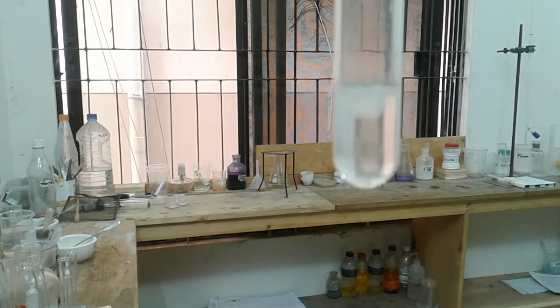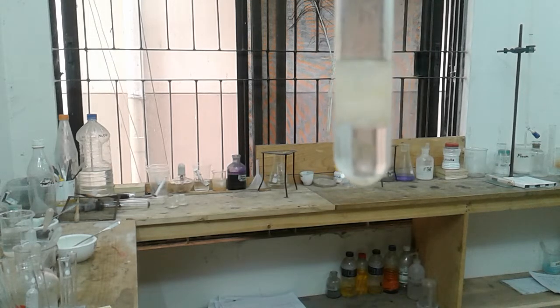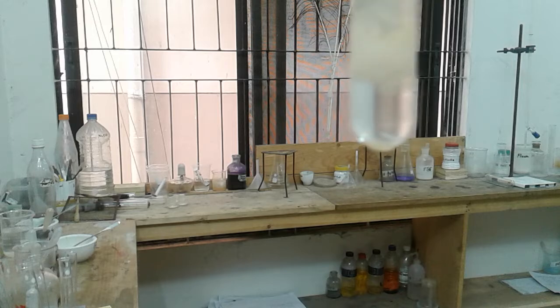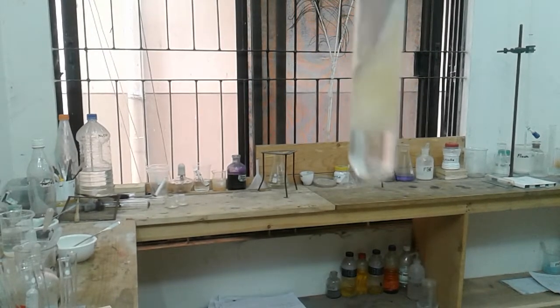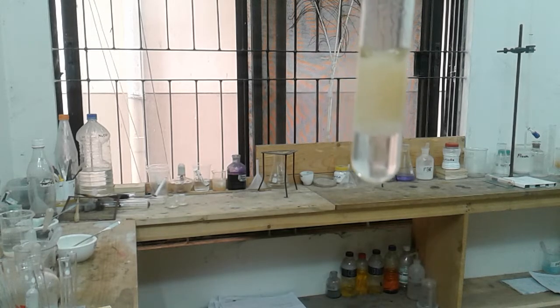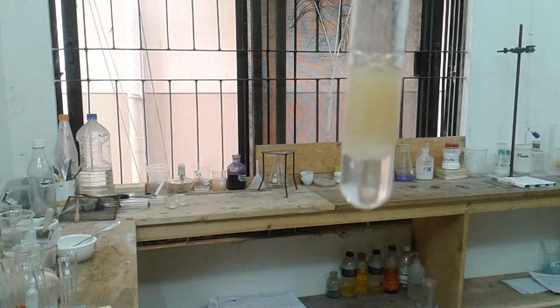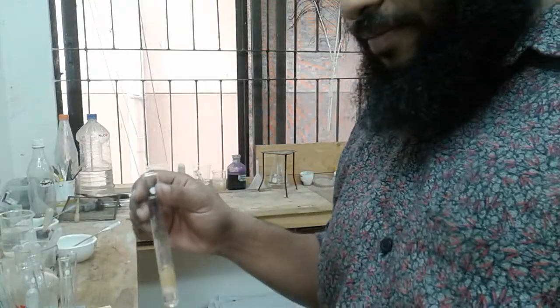So it seems to be a white precipitate, isn't it? Oh, it's turning brown rapidly. Yes, it is turning brown. Oh yes, it's turning brown. So first we have obtained a white precipitate, but which has immediately turned brown because it is exposed to air, isn't it? So what can it be?